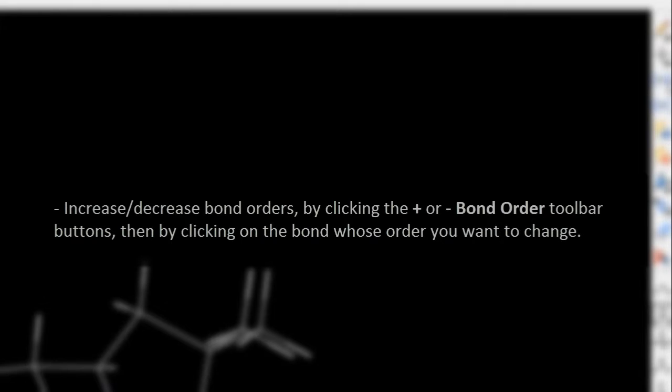Increase and decrease bond orders by clicking the plus and minus bond order toolbar buttons, and then by clicking on the bond whose order you want to change.